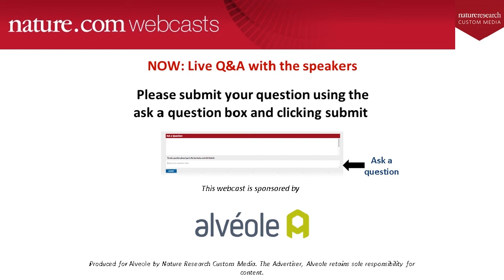And so you also need to make sure that your cells are going to be ready to split right when you're done with that. Yeah, so those, I guess, would be my tips for anybody starting to use this process. Especially if you're using this process for the first time, I would even suggest that you do your biopassivating on a separate day from your UV exposure, because otherwise it can make for a very long day if you have to check back on the protocol every step.